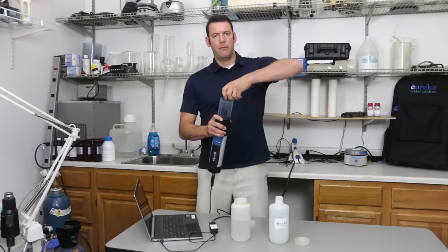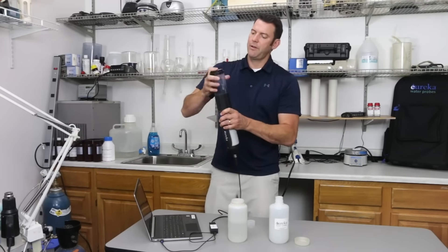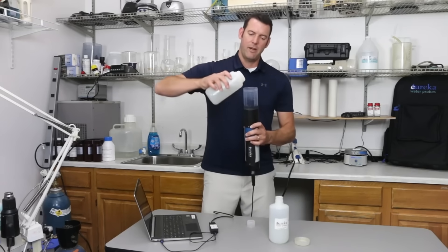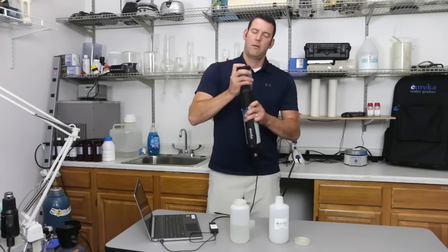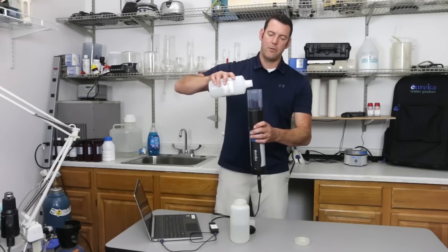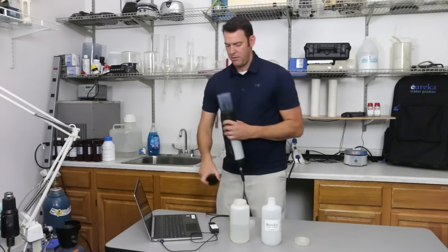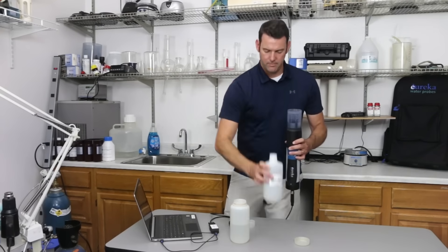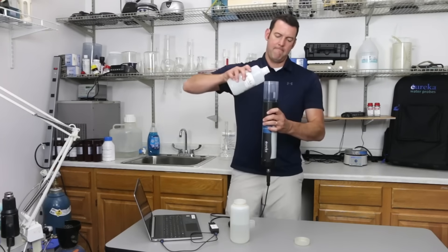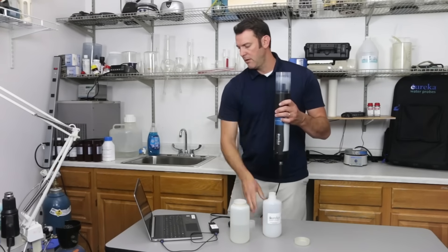I'm going to remove the lid. This is my DI water. Rinse here — you can use the lid to keep it from sloshing around. One more with DI, then pour that out. Now we have our turbidity 600 NTU solution. A little rinse there, and one more. Now we're going to fill it up an inch past the turbidity sensor — just like that — and wait for the reading to stabilize.